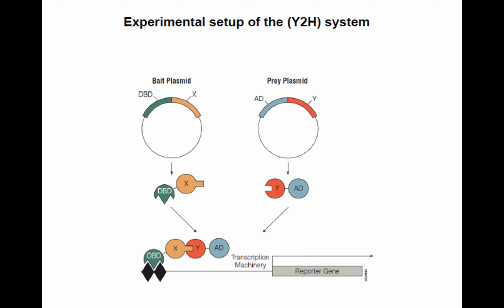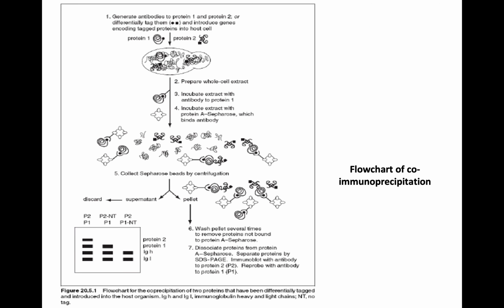After about two to three days, I actually couldn't remember the temperature that we used, but I think it's a bit higher, 30 or 40, I can't remember. Then we will see whether there are some yeast being produced. The yeast will usually be extracted, and then you purify the plasmids and do your PCR. If there are any bands produced, that means there is an interaction between the two proteins producing the reporter gene. If there is nothing in your PCR, it means your yeast two-hybrid doesn't work, and you may need to tweak something along the way. So more or less, this is how it is done.